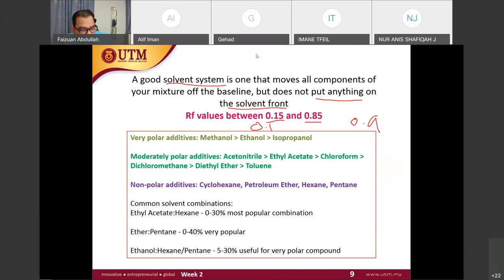You have a lot of values that I have found here. Some say that between 0.3 to 0.7. Yes. But just stick to the value that... wait for a while. I think just stick to the value that I have shown previously.